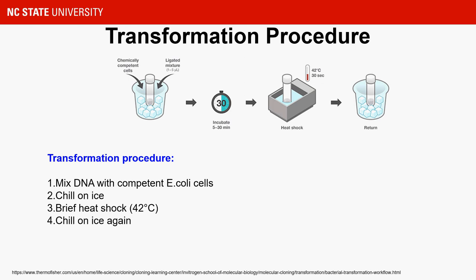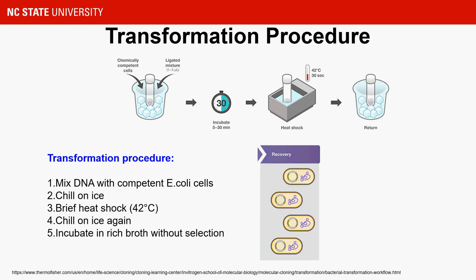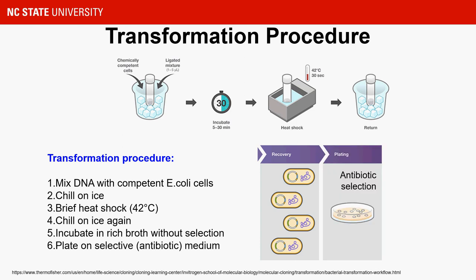Following transformation, the cells will then recover in rich broth for 30 minutes to 1 hour. Finally, we will plate these transformed cells on an antibiotic selection plate.